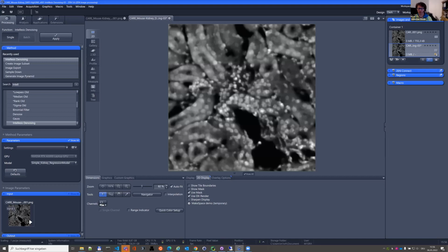Yeah, and that would be actually all I wanted to show you in this workshop. And yeah, please use the Colab notebooks. Then it's easy to play around a bit. Did you find out why it didn't work? Scikit-image, Kai, and you know, my bet is, okay, yeah, probably. I will check that, that's a good hint. Because my gut feeling was it had to do something with scikit-image, but okay. Thank you for the remark.